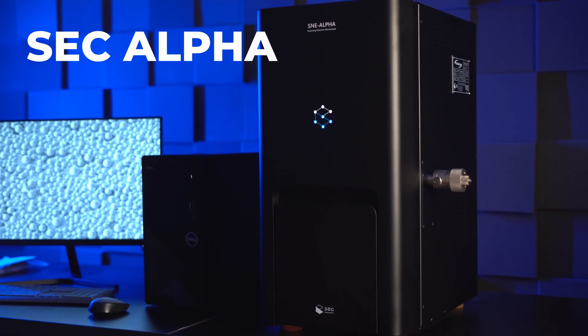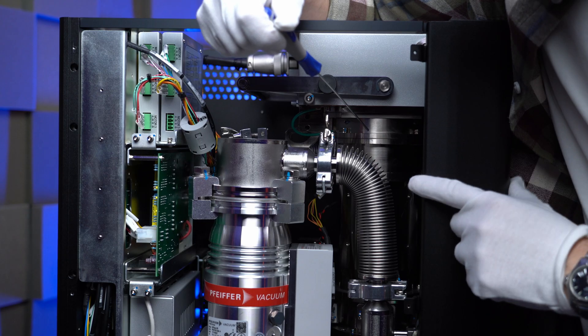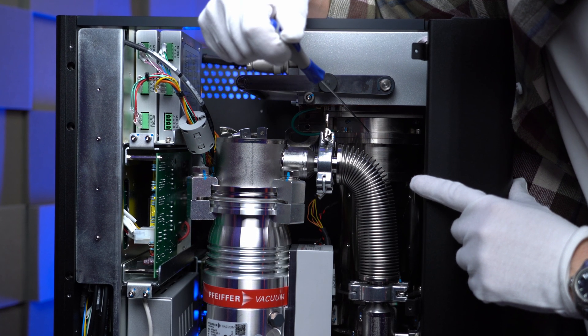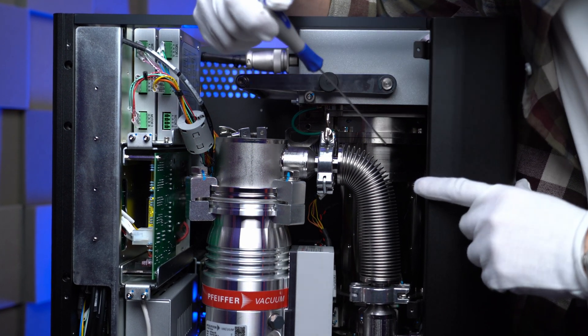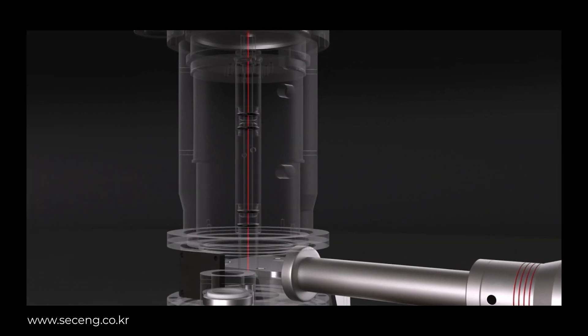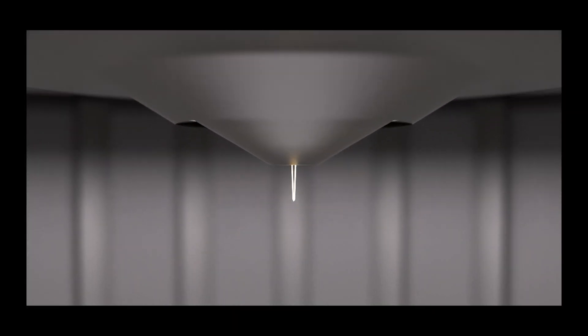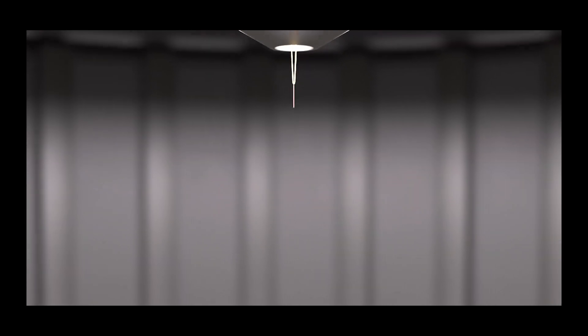This is our tabletop scanning electron microscope. Metal cylinder is the column with magnetic lenses inside. For sure we can't use ordinary optical lenses because we're dealing with the electron beam. And the physics of visible wave refraction is not working in this case.